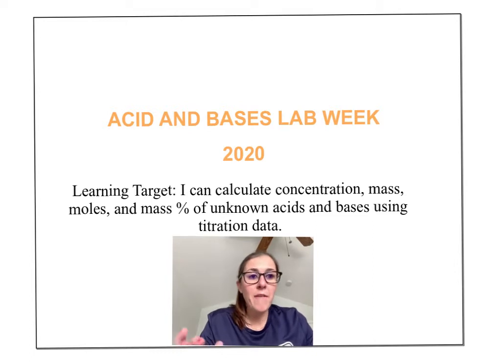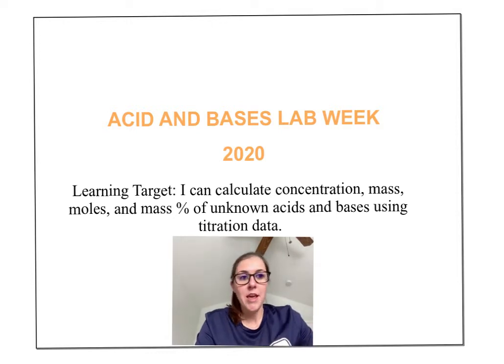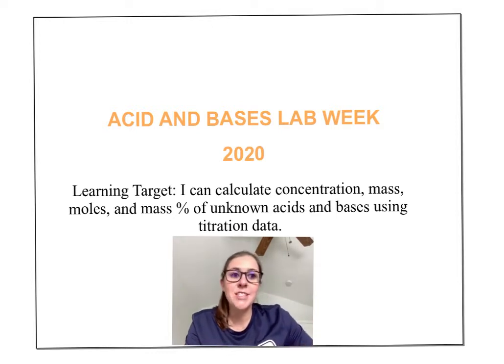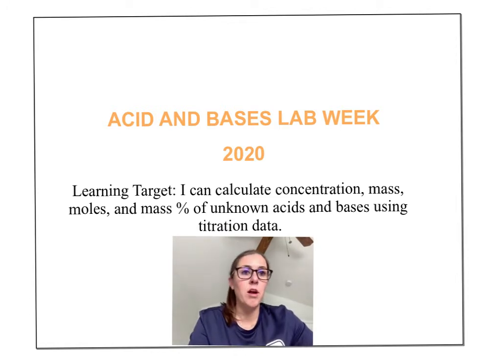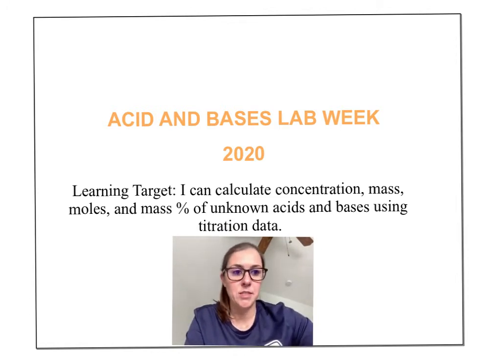Before we do that, though, I feel like we need to talk about your Ksp of calcium hydroxide lab because that was your very first titration. So I just want to talk about a couple things I noticed, actually 10 things I noticed, and that will put you in better shape for the labs we will see during lab weeks.